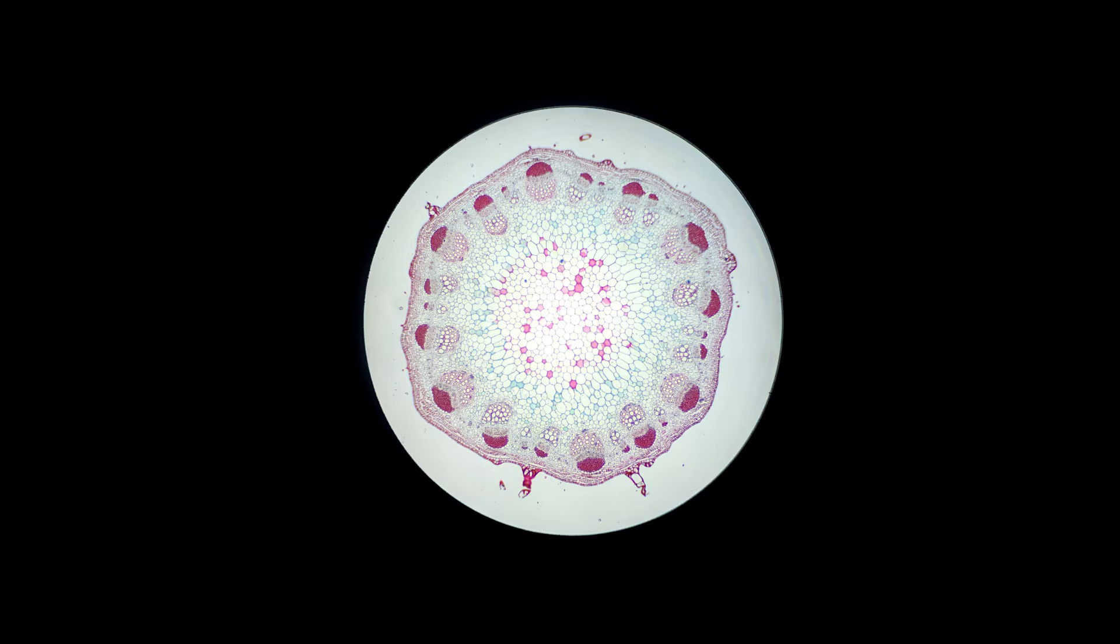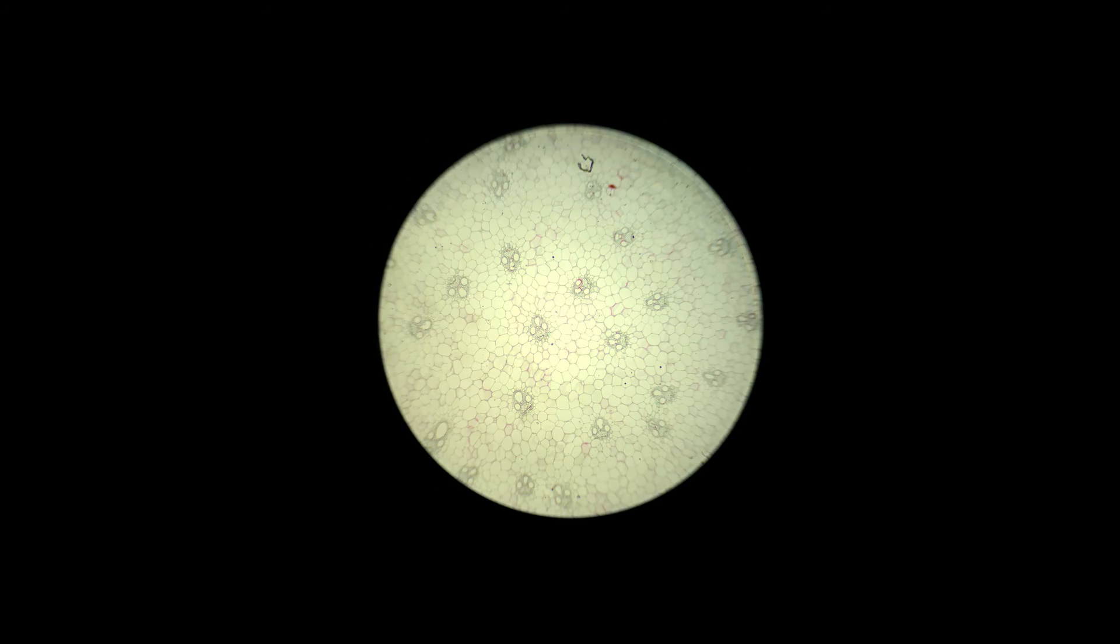All right, so let's go ahead and look at a monocot stem. So here you see there's no ring. The vascular structures are just scattered all throughout the stem. There's no real organization or pattern.